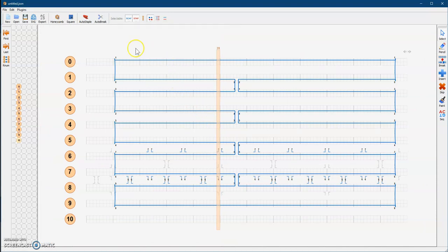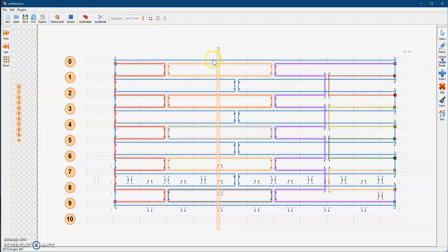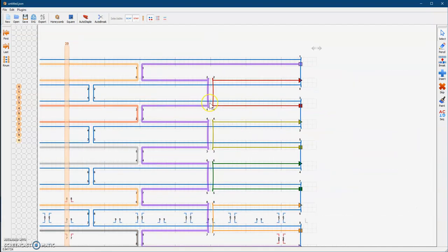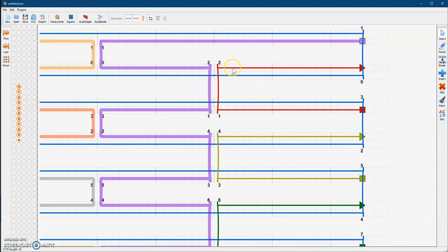Now we have to put in the staples that will help us form this structure. To add the staples — the staple strands that are going to bind everything together — we hit the auto-staple button up here. And you get all these colored staples. Notice that there's a difference between these two kinds of staple strands: you have the little skinny ones and you have the really highlighted, thicker lines.